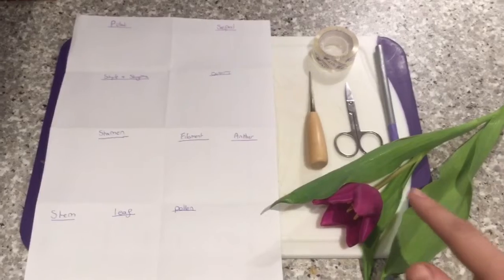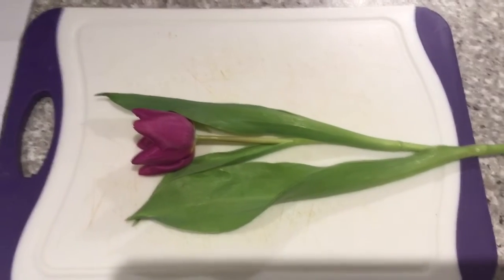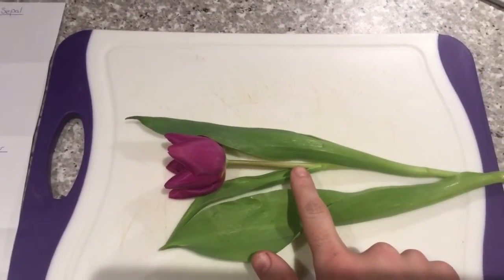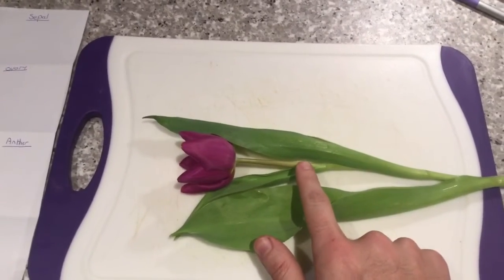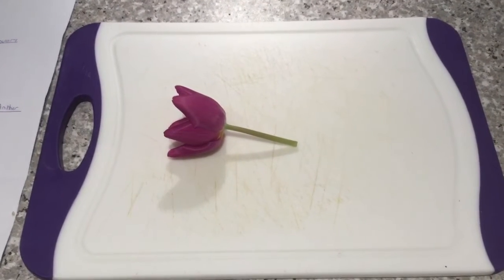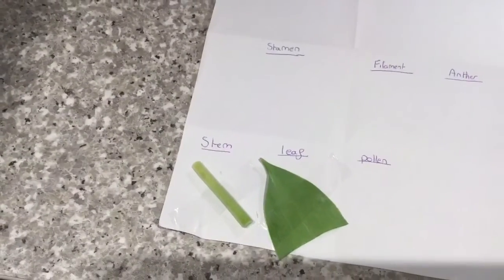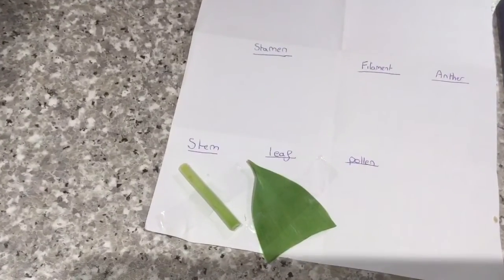We also obviously need ourselves a flower. The first step in a flower dissection is to get our flower into a workable state. We need to take the flower and cut it off so we don't need all of the long stem. So I'm going to cut it off just here. The flower is now removed from the stem — it's a lot easier to get to, we can move it around and have a look at the bits we need to. I've also taken this opportunity to remove the leaf and stem and stick these onto our piece of paper with the sellotape. We're going to do that with each piece of the flower that we take off.